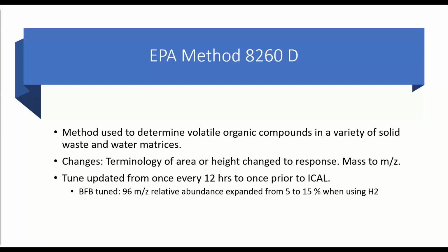Furthermore, tune updates have gone from once every 12 hours to once prior to initial calibration. I think it's also important to note that within the BFB tune, the relative abundance of ion 96 has been expanded from 5 to 15% when using hydrogen.